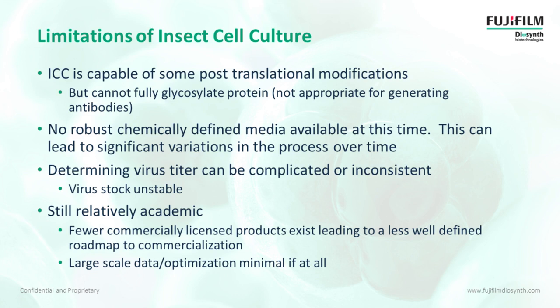One of the other limitations for insect cell culture, and this is starting to change very quickly, especially in the COVID times, is that there are very few commercially licensed products that use insect cell culture. So a lot of the commercialization roadmap pieces are a lot less well defined, and it's a little more of a struggle because you're kind of paving the way to commercialization in a lot of these processes.